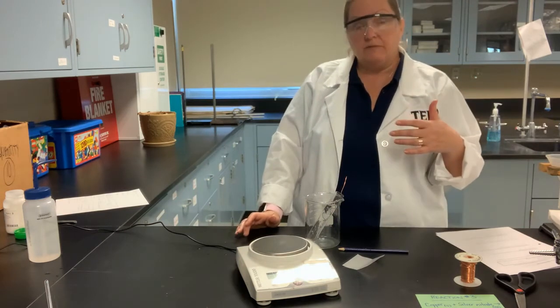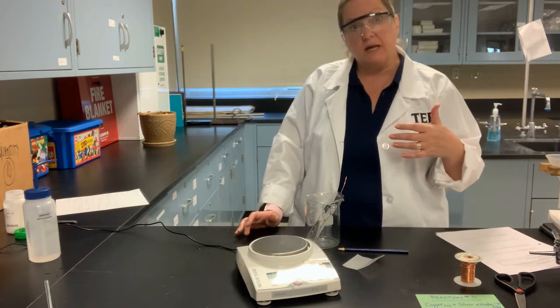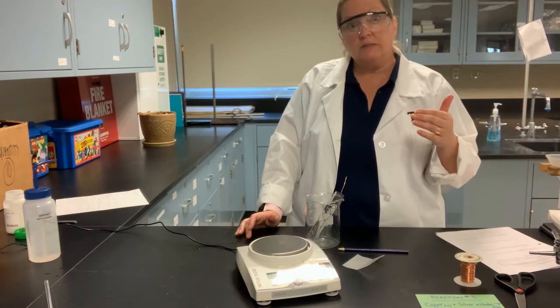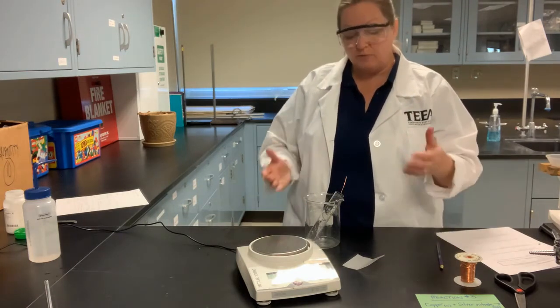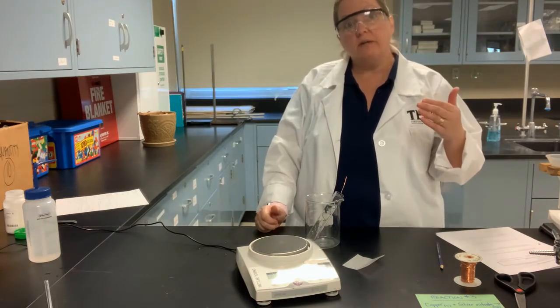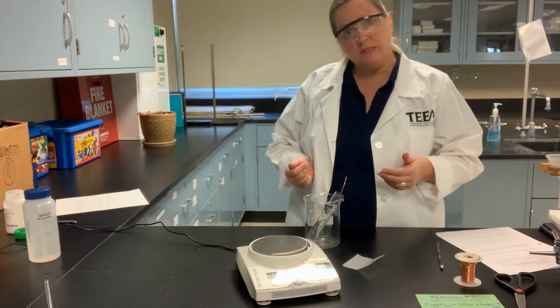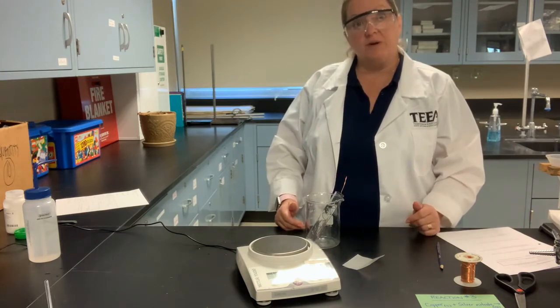Now the beauty of this being a video is this is going to allow me to insert pictures over time. So in the next portion of the video, you're going to see pictures of the initial reactants so you can see exactly what they look like before placed into the test tube, as well as pictures starting at 5 minutes into the reaction, as well as down the line up through and including 24 hours.